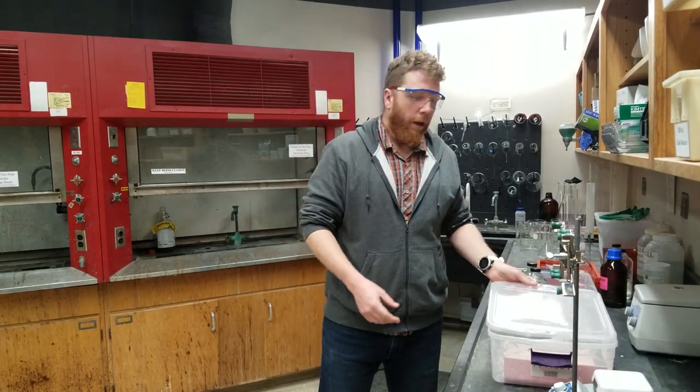Hello, it's me, Dr. Craig. I'm going to be talking about the titration experiment that you're going to be doing for experiment number five.